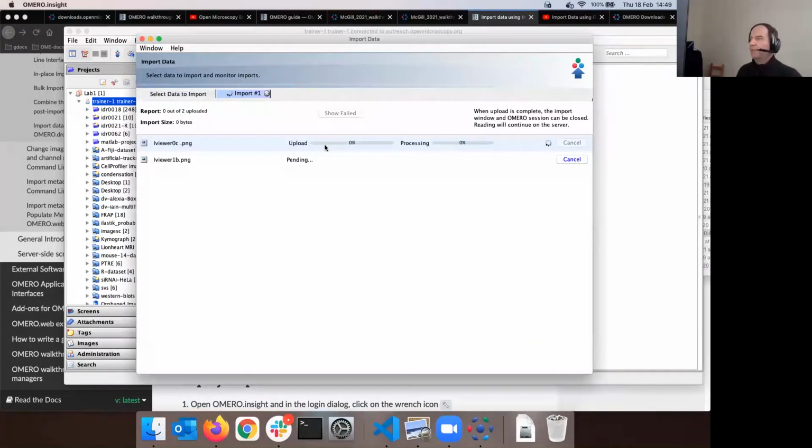It's preparing the import, and the first phase is the upload. We have 2 blue bars there. Upload means basically the image gets copied from this local Mac to that server, just as it is. This means the original file of the image.